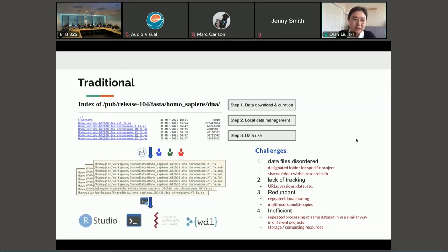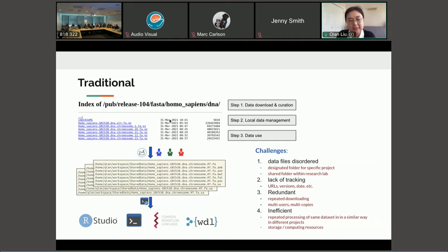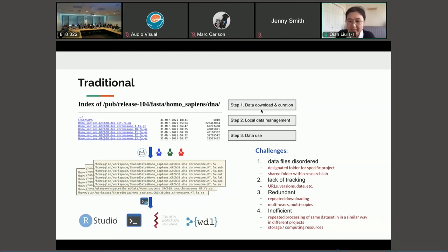So traditionally, if you want to use one of the, here I'm showing the reference genome from 1000 genome project, the first step you will need to download the data and do some basic data curation such as to index the reference genome.